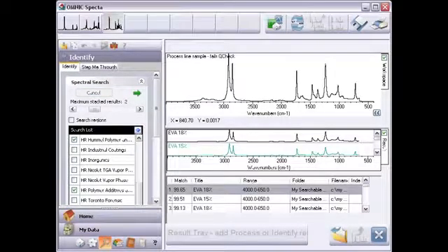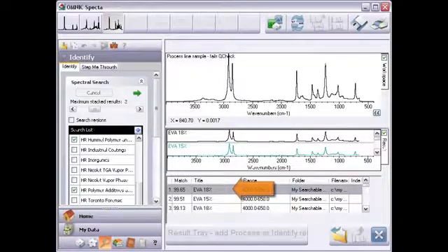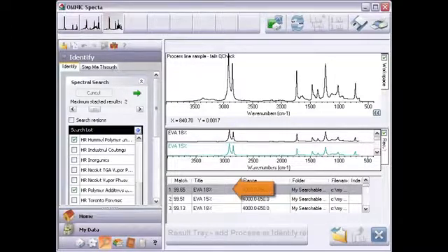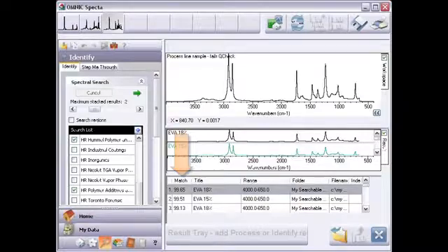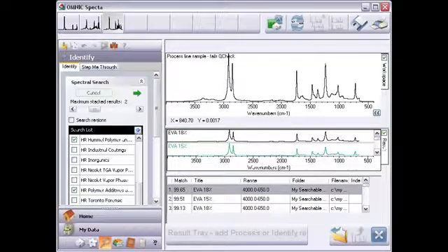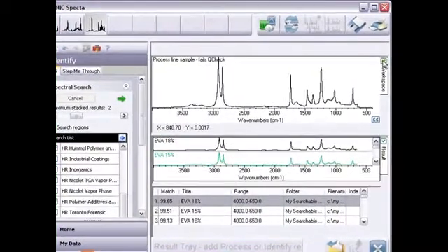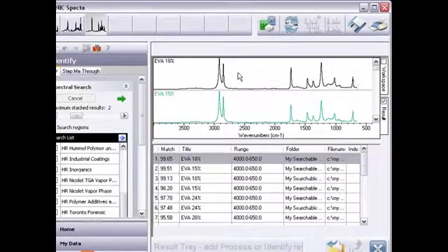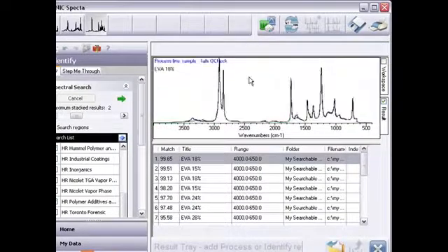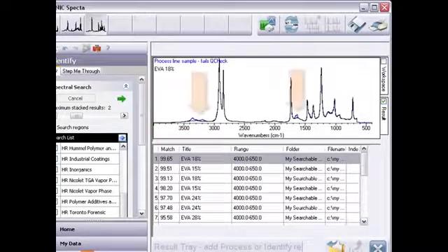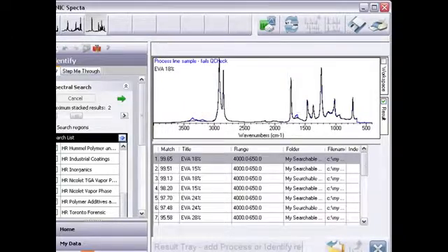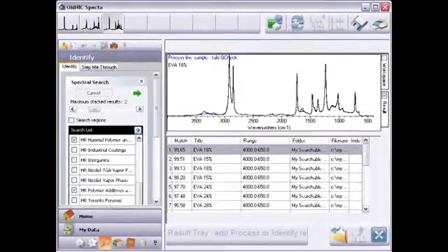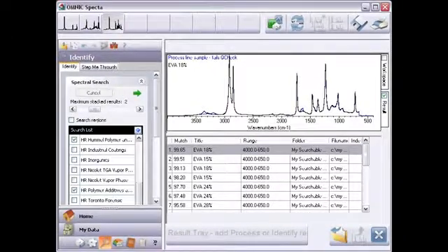The search results confirm 18% EVA as the main component. The high match number indicates we might be finished, but the visual comparison shows otherwise. For example, when I overlay the best match with my original spectrum, I see significant, non-random differences in several regions. This indicates something else may be present. I already suspected this because my quality check failed.